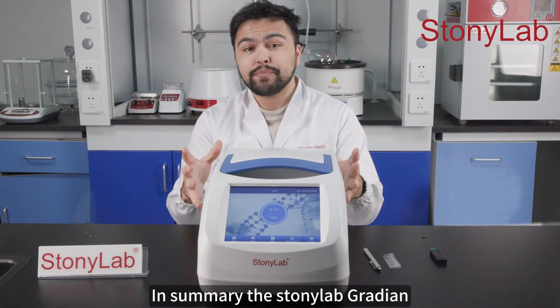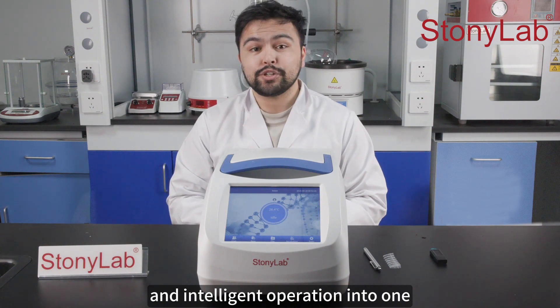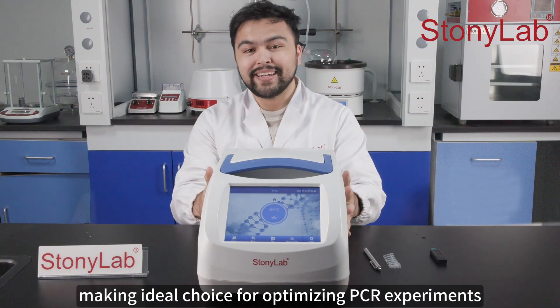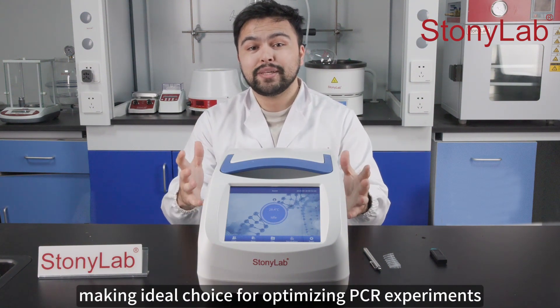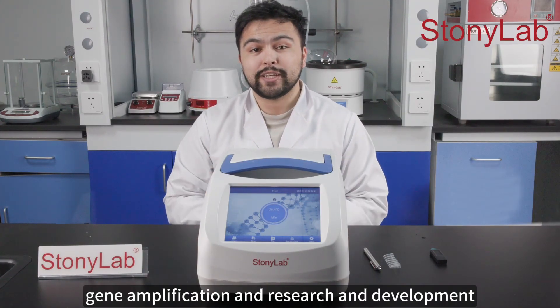In summary, the StonyLab Gradient PCR instrument combines multi-temperature gradients, high-precision temperature control, and intelligent operation into one, making it an ideal choice for optimizing PCR experiments, gene amplification, and research and development.